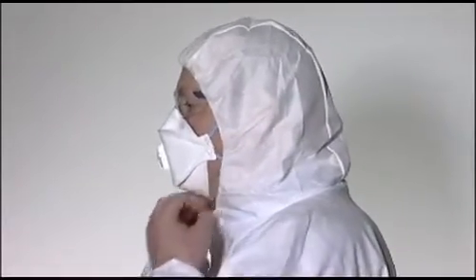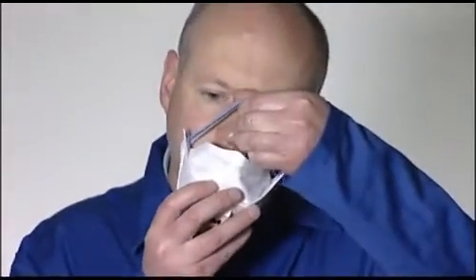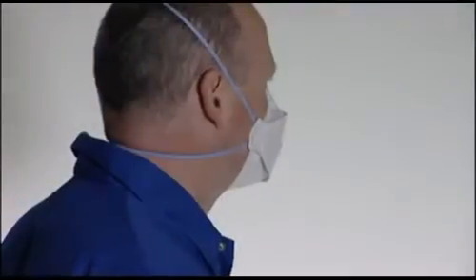Ensure that your safety eyewear is compatible with your respirator and does not interfere with its fit. 3M Aura respirators should be changed if you feel breathing resistance increase, if they become damaged, at the end of the working shift, or as directed by your company's policy on respirator use. For more information on these products, contact your local 3M representative.